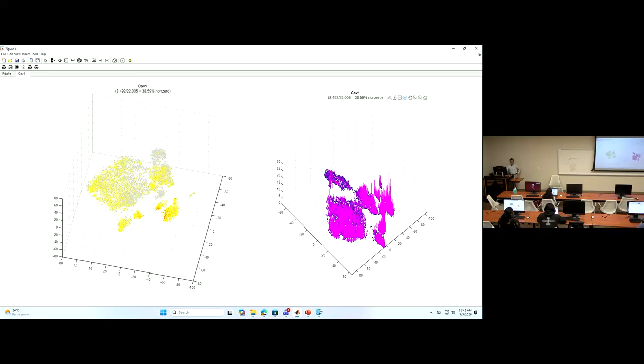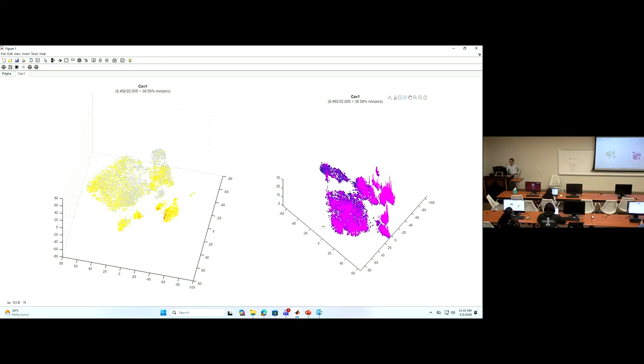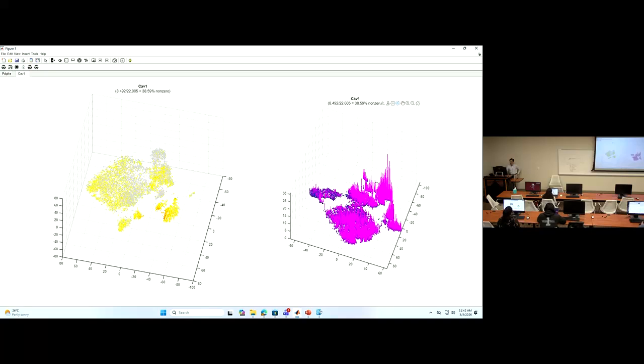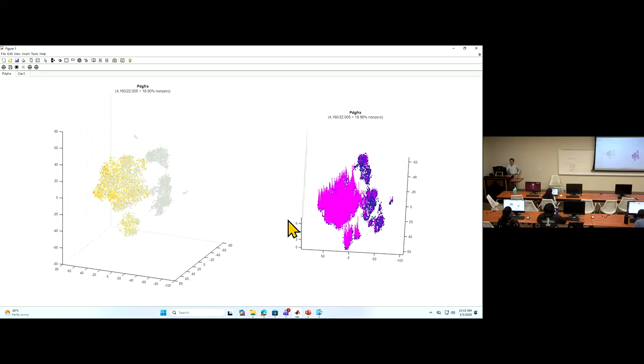So we'd better know if there's communication between this. It could be between these subclusters, this subcluster here, to this center, right?